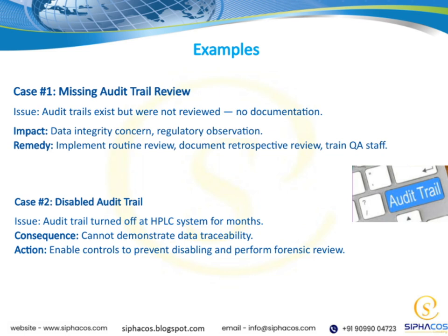It's also important to document these reviews, including retrospective reviews if needed, and to ensure that QA staff are properly trained on this process. Both cases highlight how critical it is to maintain and review audit trails diligently, as they are fundamental to ensuring the integrity and traceability of our data across the entire quality system.